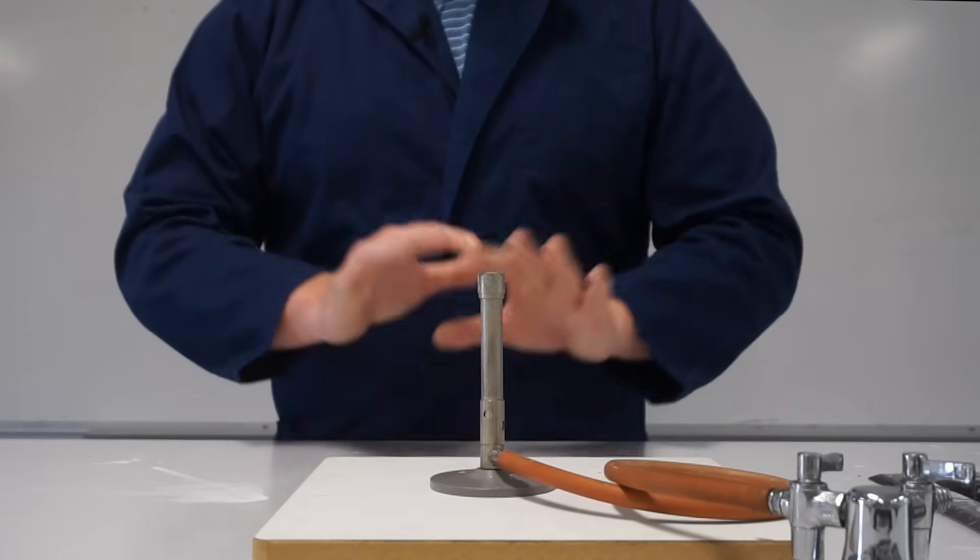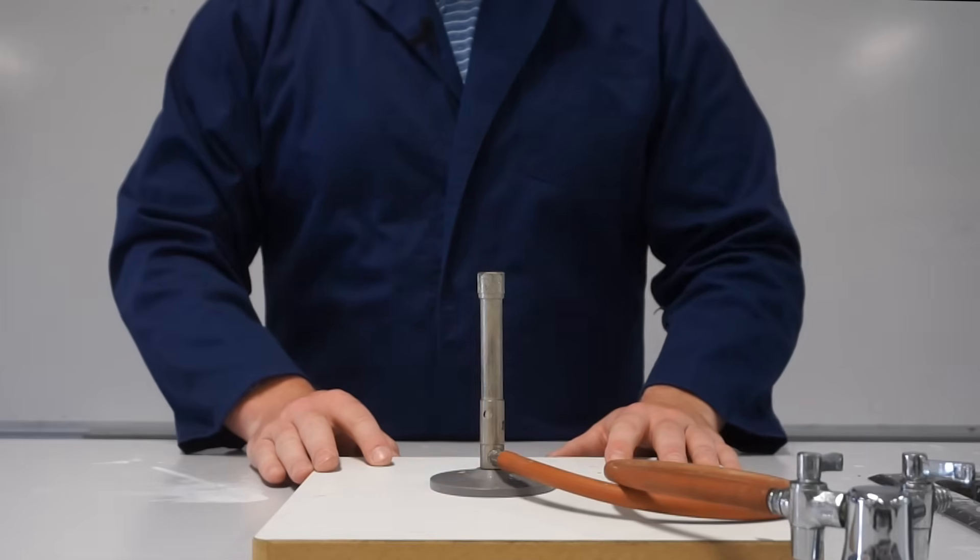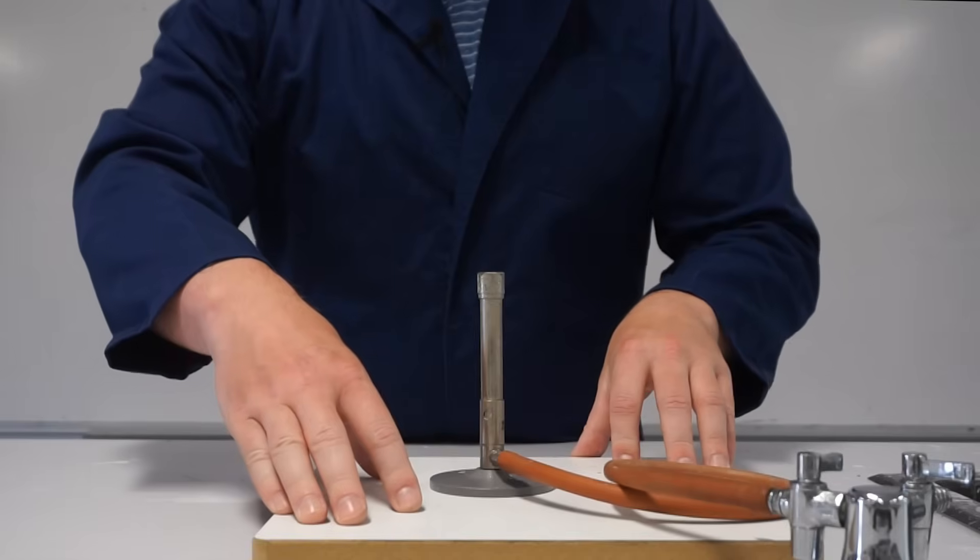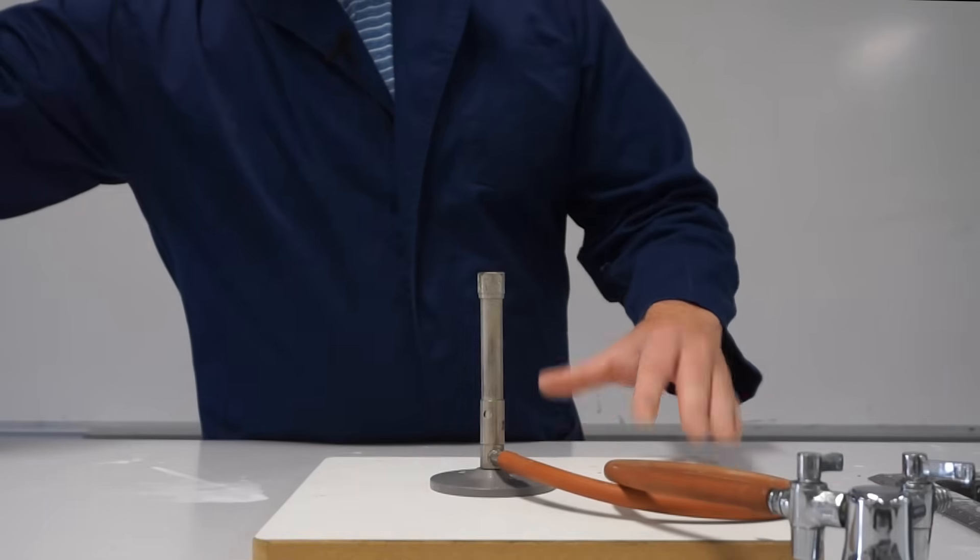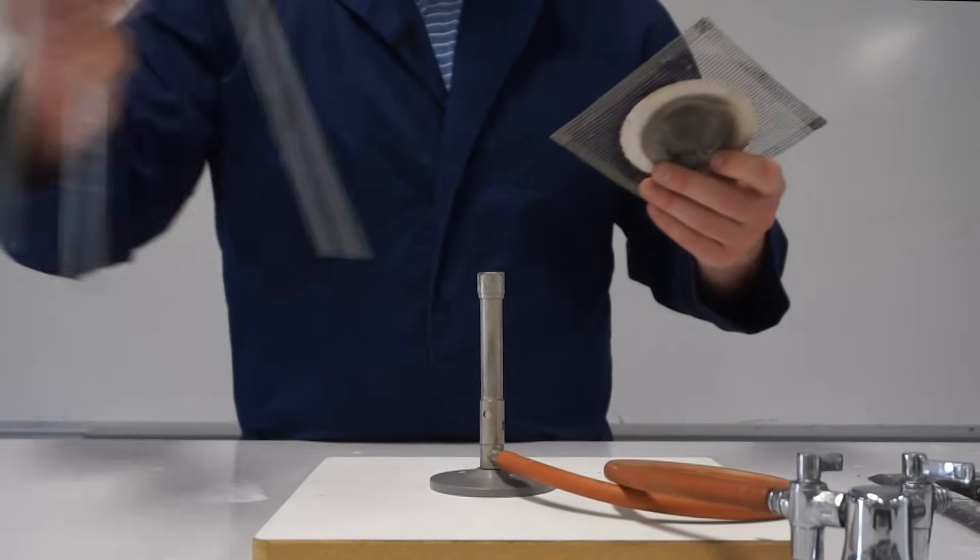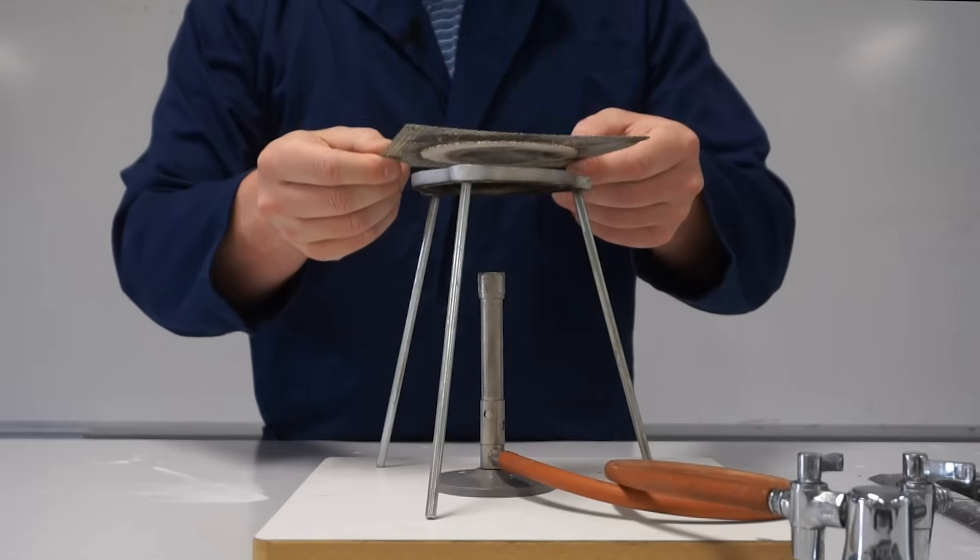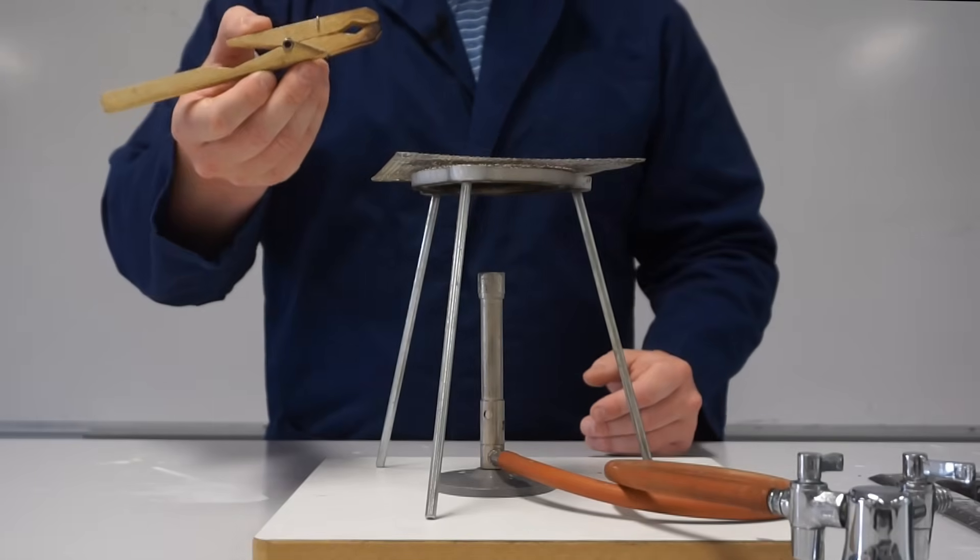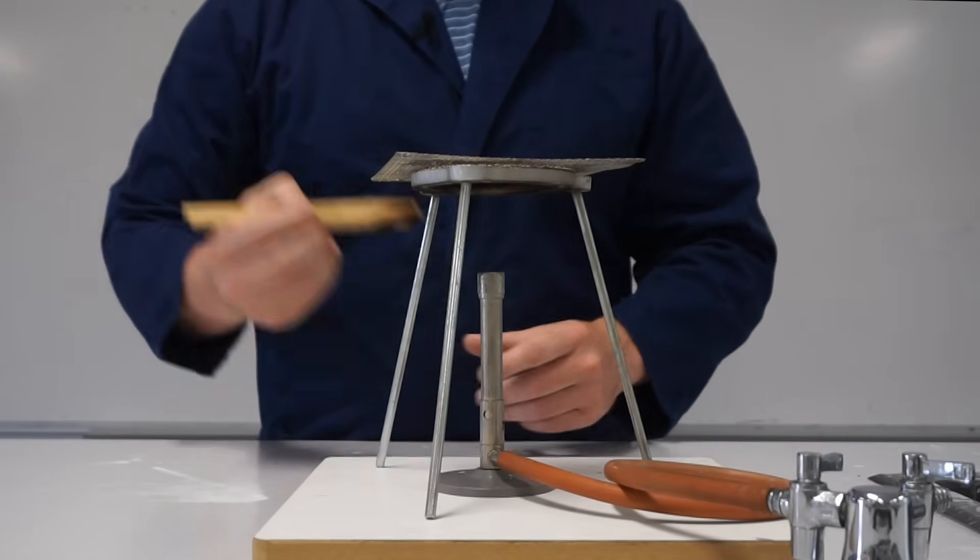Also ensure that you've gathered all of the other equipment that you'll need for this experiment. That could include your heat proof mat, a gauze mat and a tripod if you're heating up things such as beakers, and also a peg if you want to hold something above the flame.